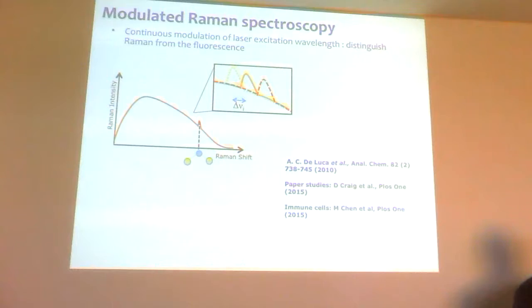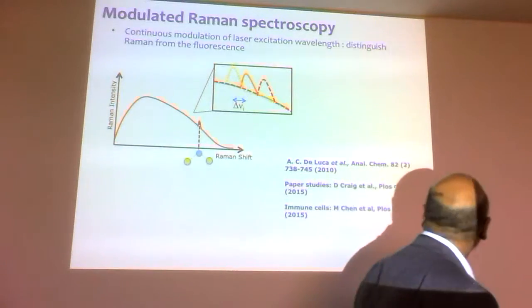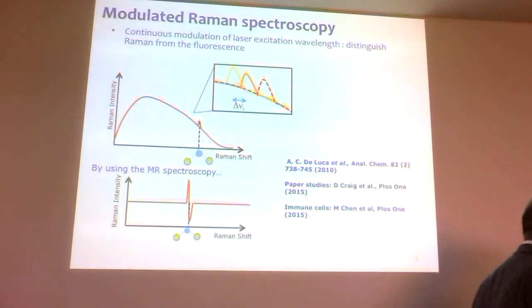Not too surprisingly, without even any calibration, if you wiggled the laser wavelength, PCA1 immediately picks out the Raman spectrum and rejects all the fluorescence, just because that's the maximal variation that you'll see between those two groups. That's an example of something we and other groups have also used variants of. And if you do that, you get a beautiful derivative signal. This is very, very nice and powerful, and is only just being used by quite a few groups now, using this or variants of this.